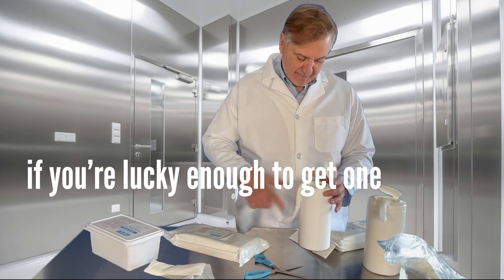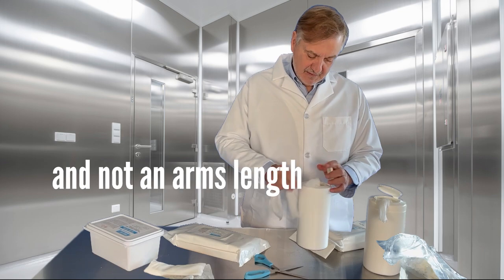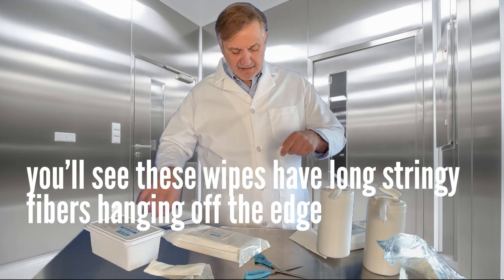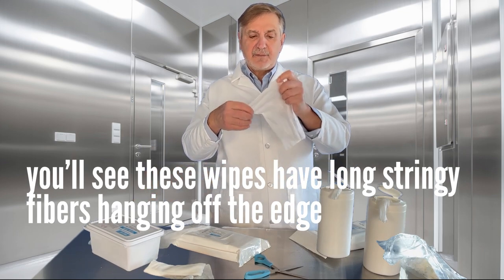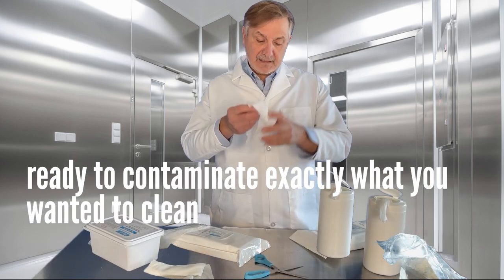If you're lucky enough to get one and not an arm's length, you'll see that these wipes have long stringy fibers hanging off the edge, ready to contaminate exactly what you wanted to clean.